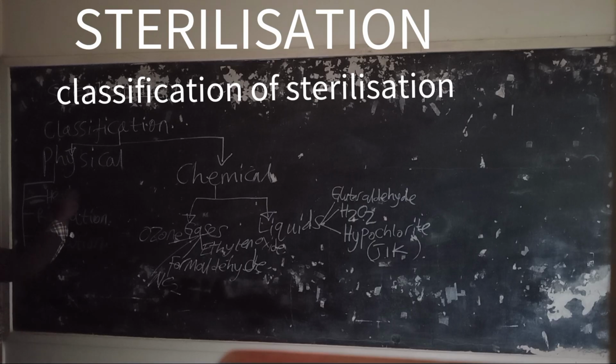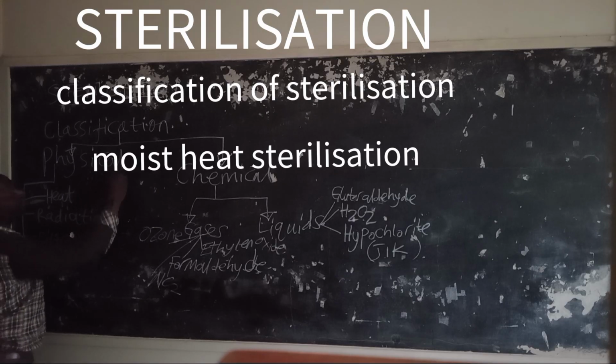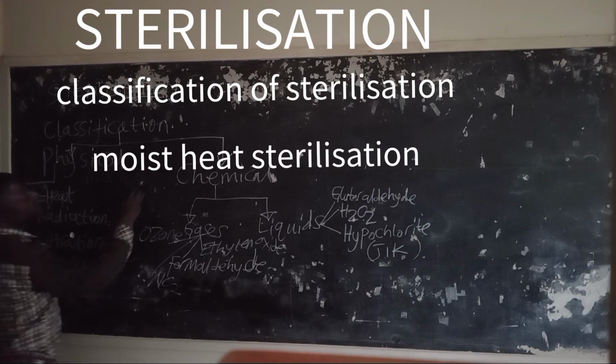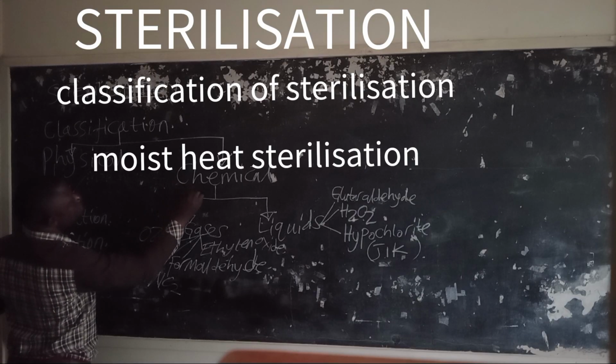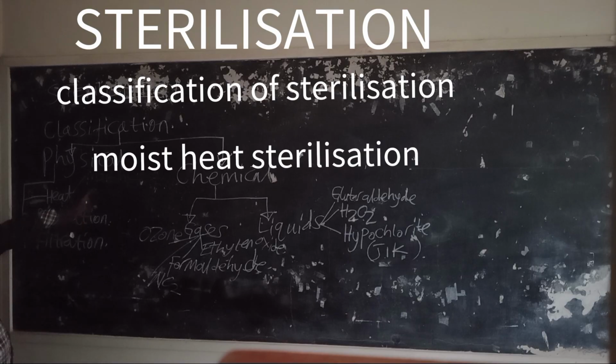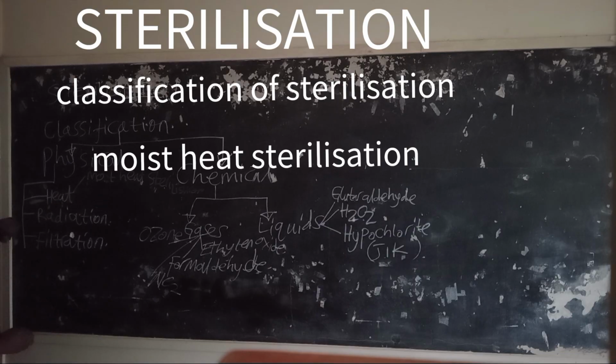Now, this one, under heat sterilization, is subdivided into moist heat sterilization. We have another class which we call dry heat sterilization.